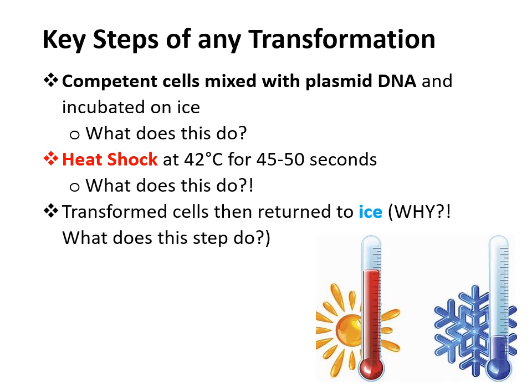The reason you do the heat shock step is because that heat opens up the pores, those pores meaning those nice holes on the outside of the bacterial membranes, okay? So it opens up the pores of that bacterial cell, and since you currently have that bacterial cell coated with the plasmid DNA sticking there, this helps force the plasmid DNA into the bacterial cells.